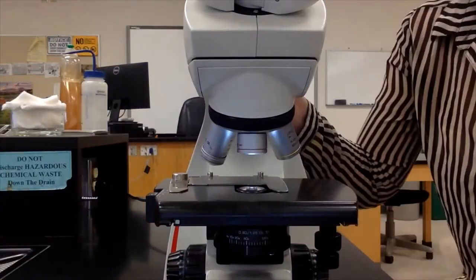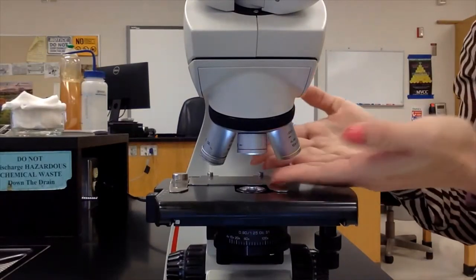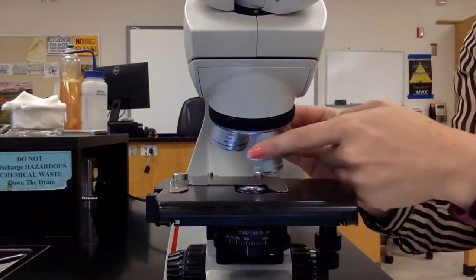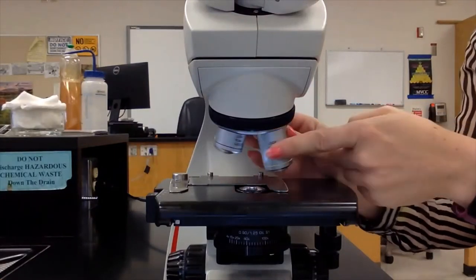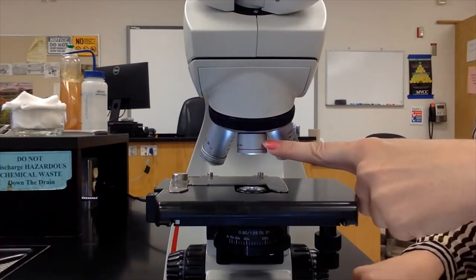Now this microscope actually has four different objective lenses. They pivot around a central dowel and they snap into place. Each has a specific magnification.